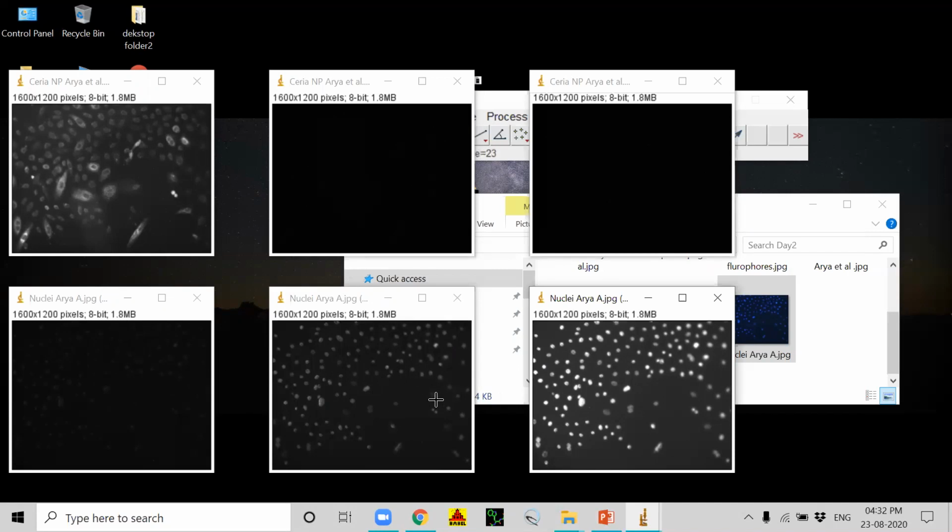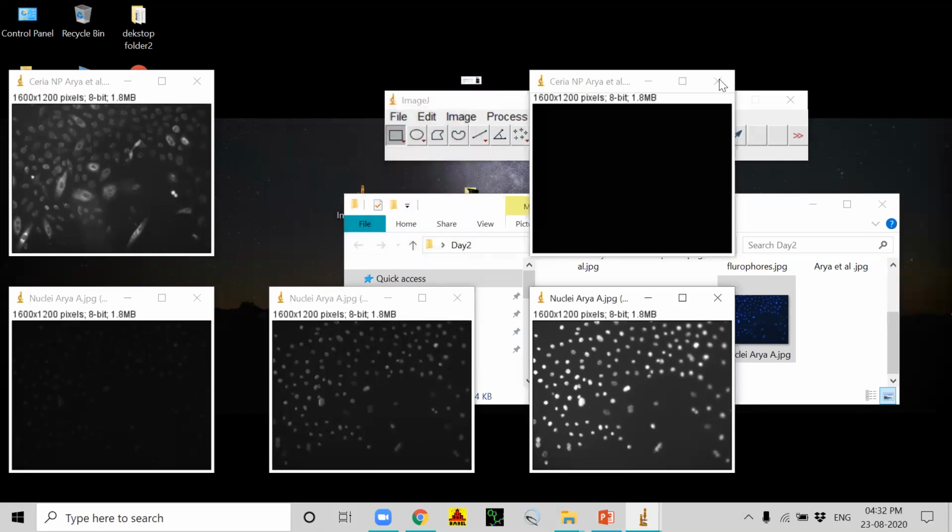Now you should have realized that what we see with our eyes may be misleading, as this image had some green color and some red color which we don't need. So now what we have to do is simply delete the other channels which we don't need.